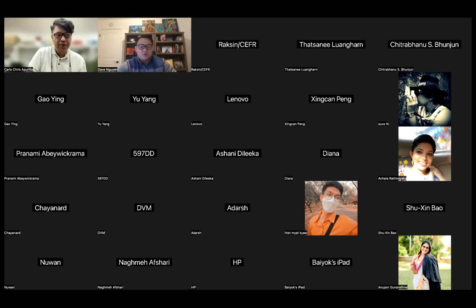Thank you. That's a great question. Thanks for asking that. In terms of masking, right now we have two options. The simplest option is to do manual tracing, because that allows the expert to be very precise in what they outline. The tool we created to make manual tracing easy is that we give you 4 colors to pick from: bright red, bright green, bright blue, and bright magenta. You can outline on your image, and once you upload that image with the outline, we have a tool that extracts those 4 colors out. So we automatically create the mask for you. That's the tool we created to make manual tracing easier.